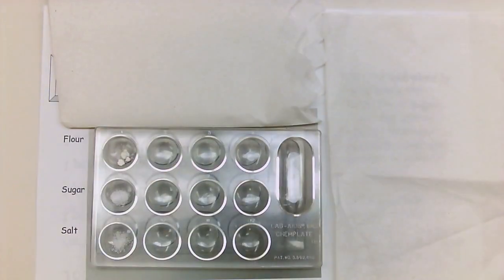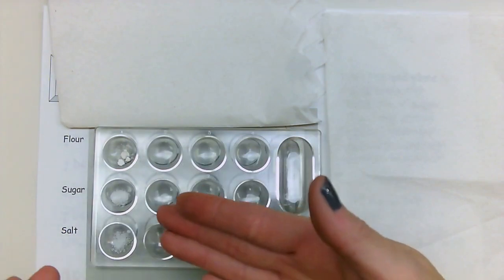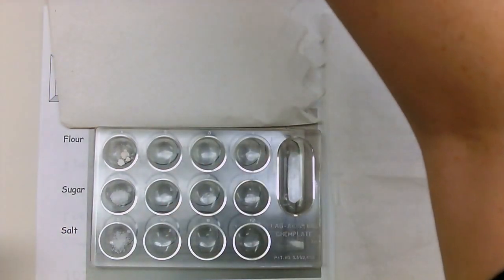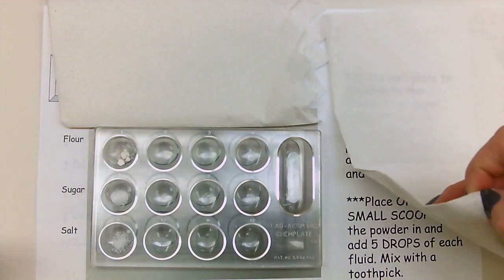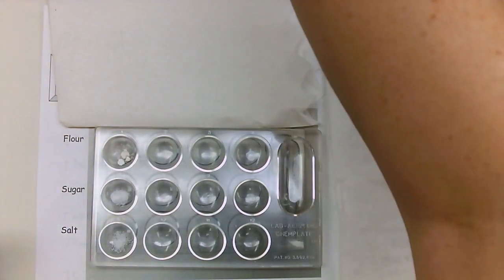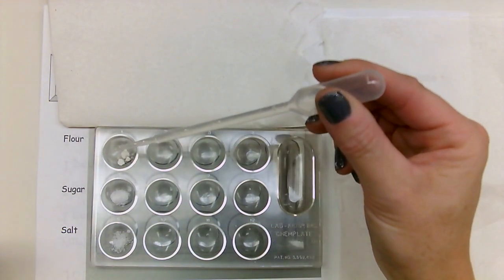So we have these 3 solid substances, and then we have our mineral oil, and I am going to put 5 drops into each one and then mix it with a toothpick.